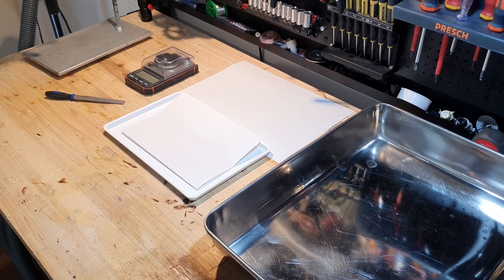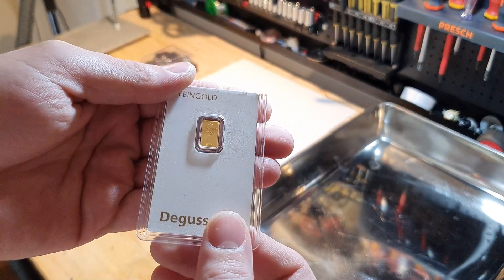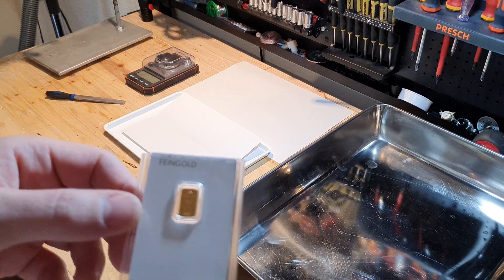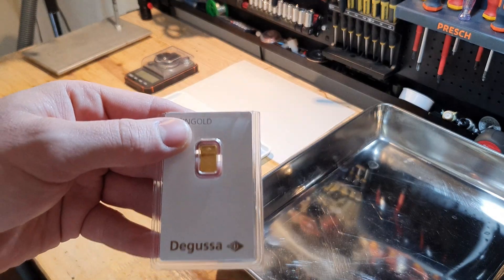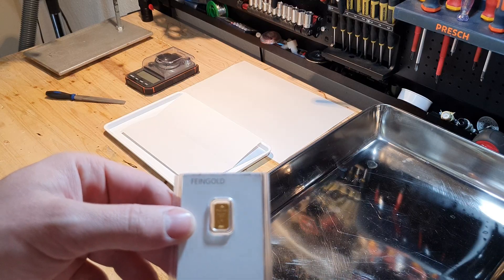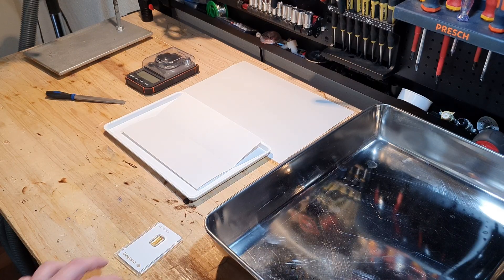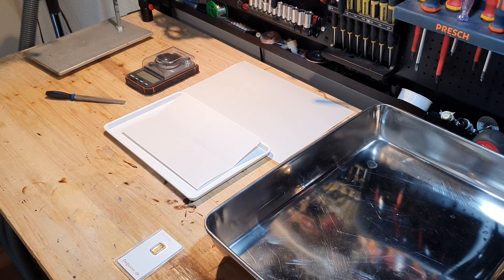To make the cesium auride we first need some gold. This is a gold bar — one gram of 99.99% pure gold. In the original paper they precipitated fine gold dust out of solution by reducing a chloroauric acid solution with oxalic acid, to get the highest possible surface area. I don't have the chemicals to do that, so I am filing this gold bar to get fine shavings. My first try will use half a gram of gold.